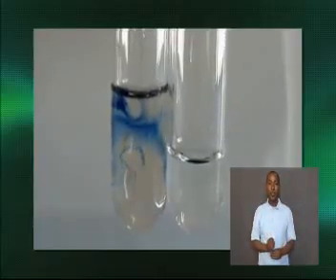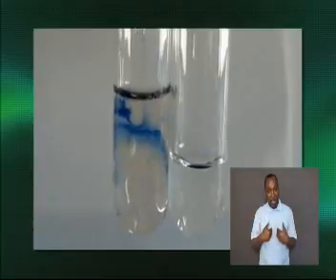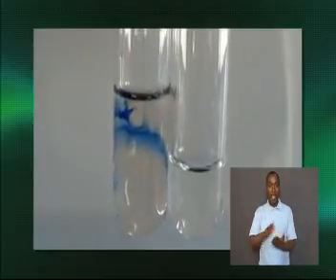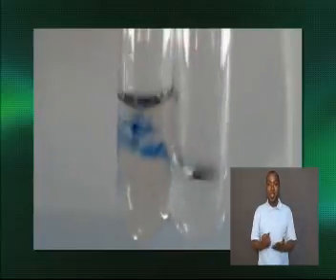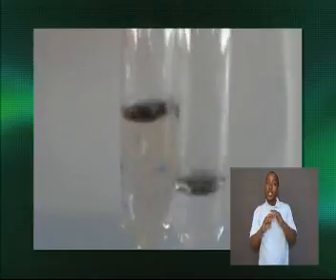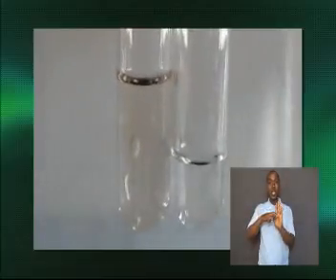If the substance contains vitamin C, a gradual fading of color will occur. This is because vitamin C has a reducing action on the DCPIP reagent, which makes it lose its color.